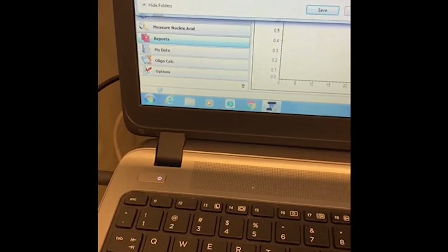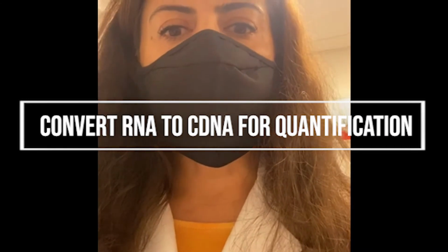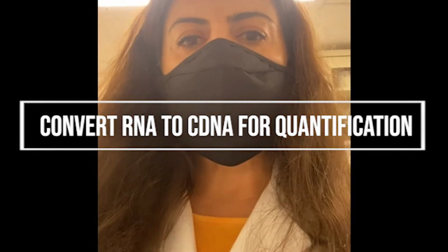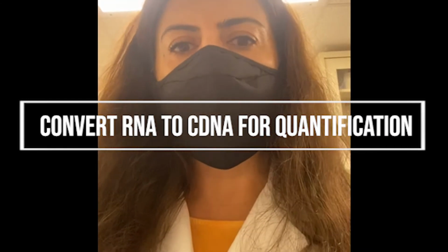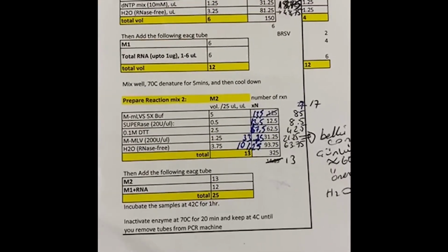Then I can reach it whenever I want to. So now we extracted our RNA and measured them. The next step is to convert the RNA to complementary DNA, which is cDNA, so we can quantify it through the RT-qPCR. So we are going to use reverse transcriptase enzyme and follow a protocol to convert our RNA to cDNA. Our protocol I'm going to follow.